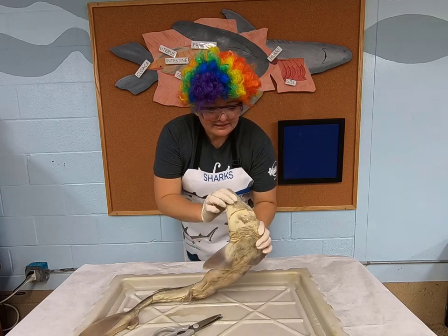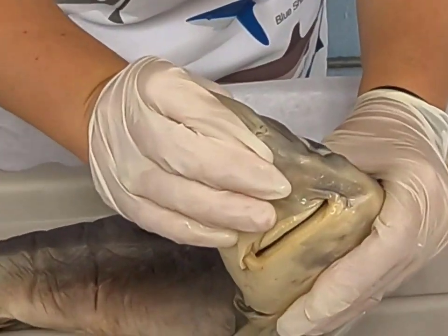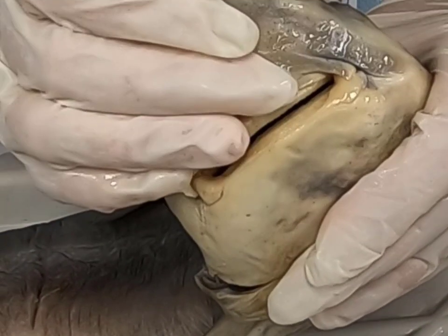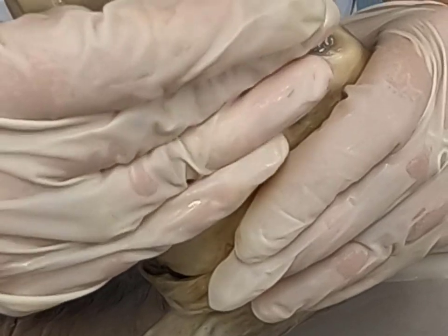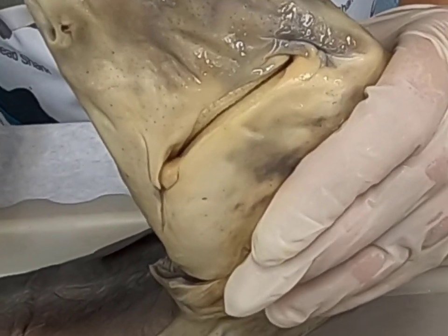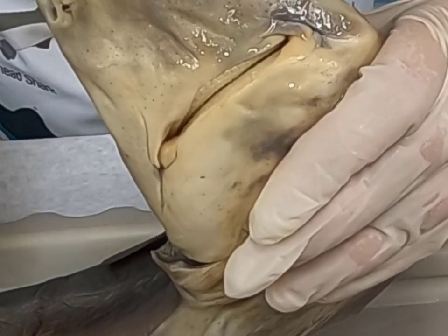All right. So sharks do have teeth. Their teeth are pretty cool. Their teeth are in rows. And they kind of have this conveyor belt motion to where they'll drop a teeth layer, and then the new ones will roll in. And sharks can have between 7 and 15 different rows of teeth that they'll use through their lifetime. It depends on the species.